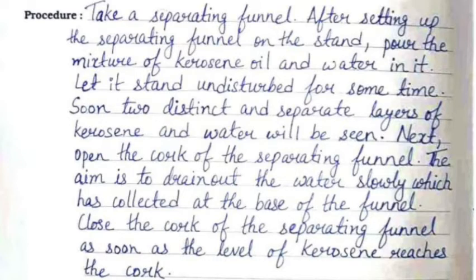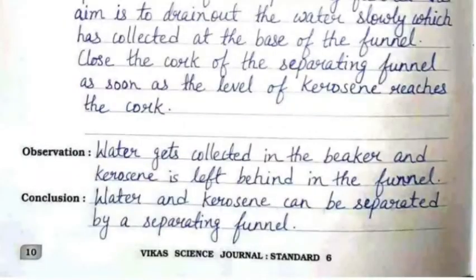Next, open the cork of the separating funnel. Drain out the water slowly, which has collected at the base of the funnel. Close the cork as soon as the level of kerosene reaches the cork. The observation is: water gets collected in the beaker and kerosene is left behind in the funnel.